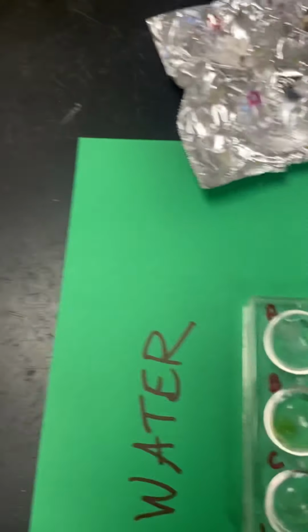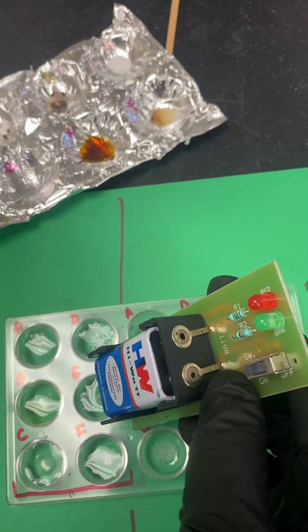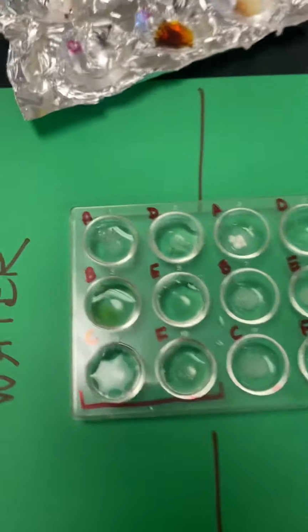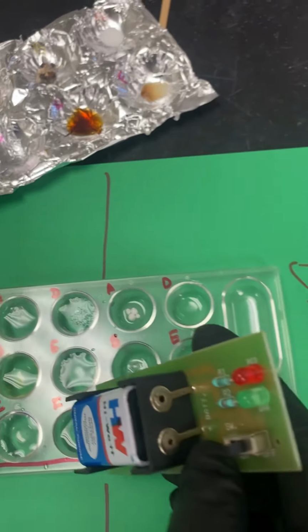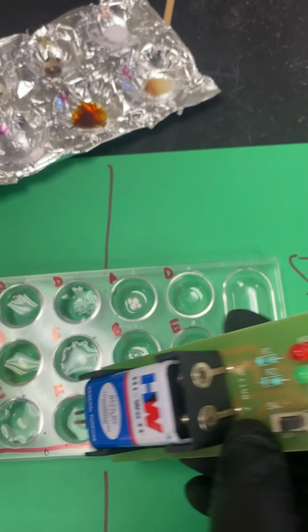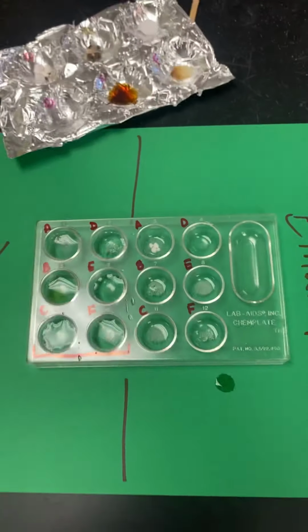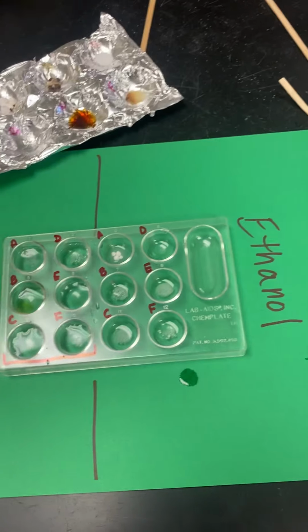And then sucrose. Does not. And our final one is Tylenol. And no. So that was your last test for the lab. Your data table should now be complete. And you can answer those lab questions.